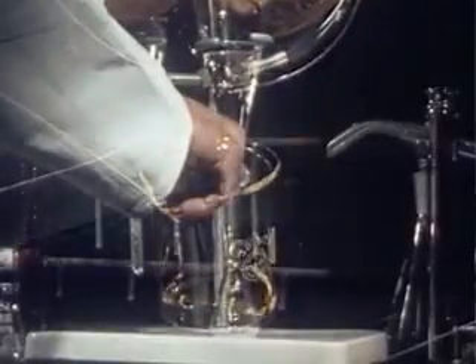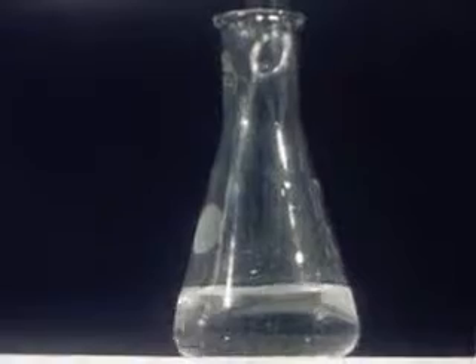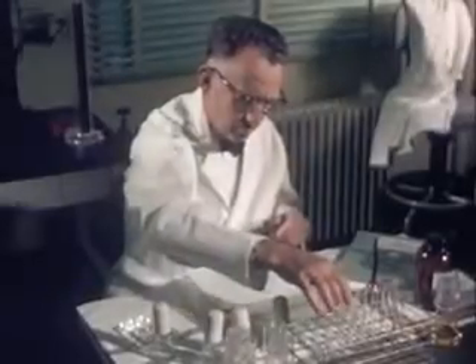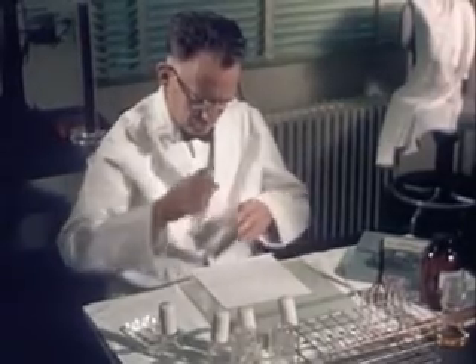To this, he adds solvents and extracts chemicals from the fat. He then applies the extract to chromatographic paper. This is tedious, time-consuming work, but it pays dividends in consumer protection.